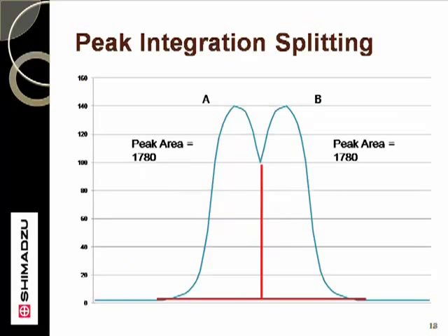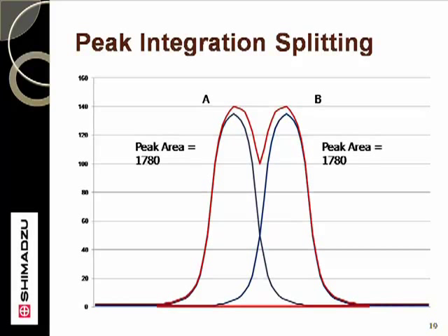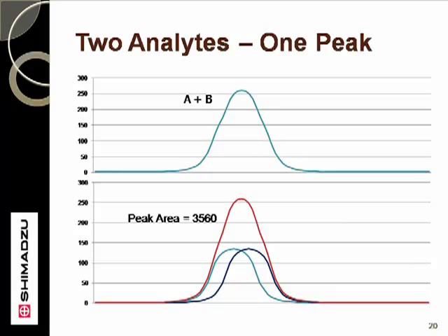If the peaks co-elute much closer, then the situation seems worse, but the peak areas are still evenly distributed at 1780 each. This is due to the equal size of the two analyte peaks — the splitting at the valley evenly splits and distributes the mixed areas from each peak. If the co-elution is even closer, the resulting additive effect may make the two peaks elute as a single peak. If this is the case, there may be no way to split the peaks, and the resulting mixed peak is the sum of the peak areas, or 3560.